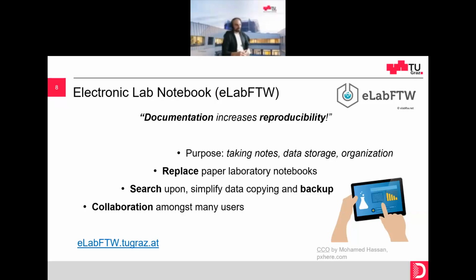The URL where you can find our institutional eLabFTW is elabftw.tugraz.at. And as long as you are a member of TU Graz, you also have TU Graz credentials, and with those you can just use the SSO and log into the tool itself. So you could do this right now if you want, actually. But of course, if you want to work in a group, you have to be in contact with us first.